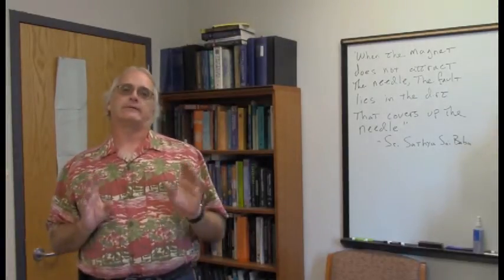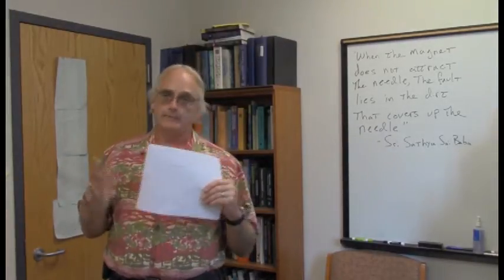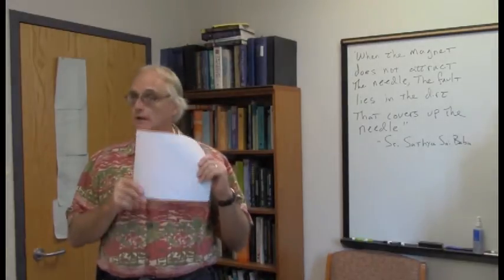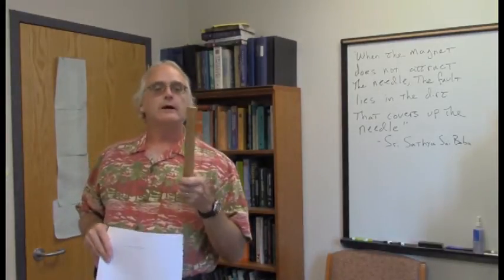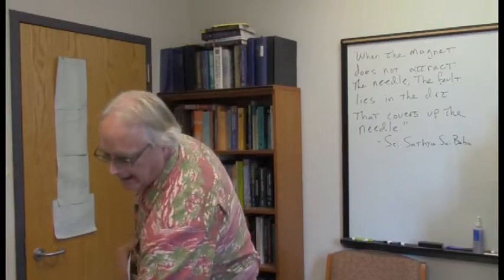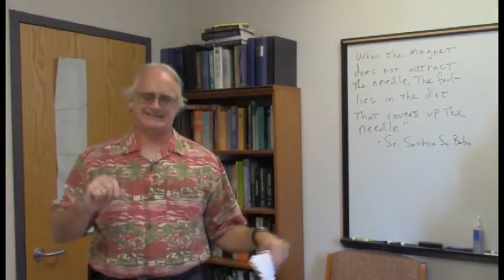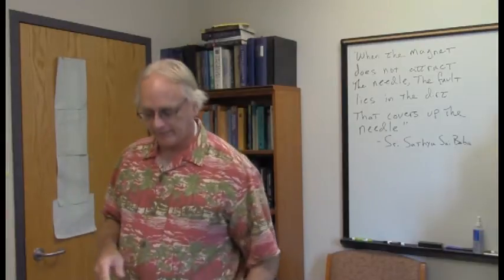The first thing I do is I take all the spectra and print them out. I have them here on paper. I naturally just think better on paper. I know I'm old and decrepit. I have them up on the computer screen as well, but I'm going to be drawing lots of notes on paper here. I have my handy dandy trusty ruler. I've had this one for years. I've used it on lots of NMR spectra. Yes, I love you too. And a pencil, simply because I'm going to be marking things, and I'm going to be erasing things. I'm going to be writing something, and then have to erase and go back and do that sort of thing. So these are the things that I have sitting here in front of me.